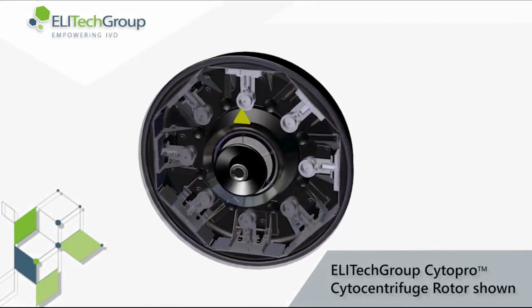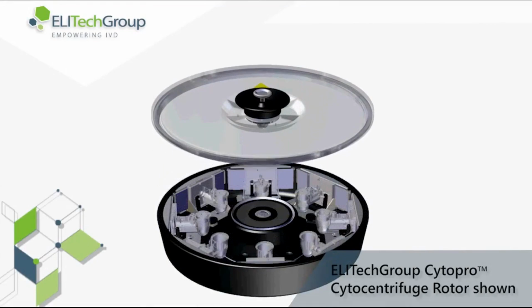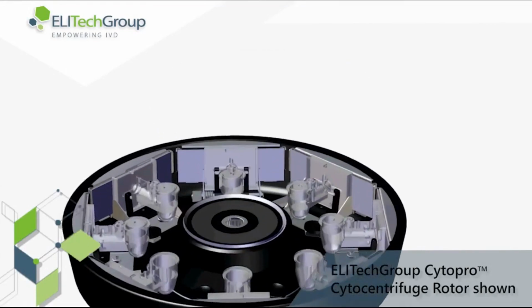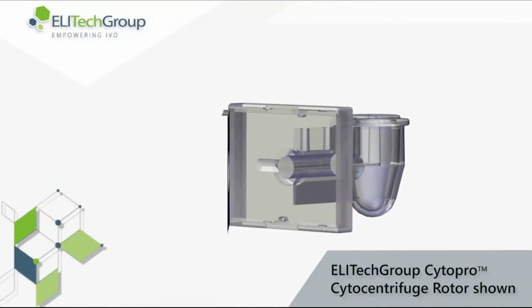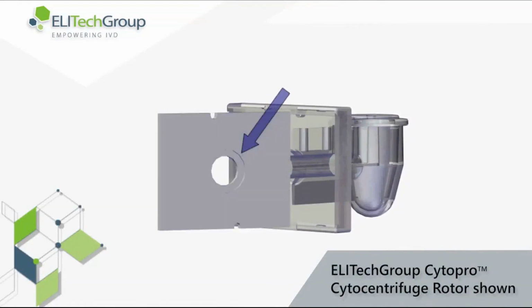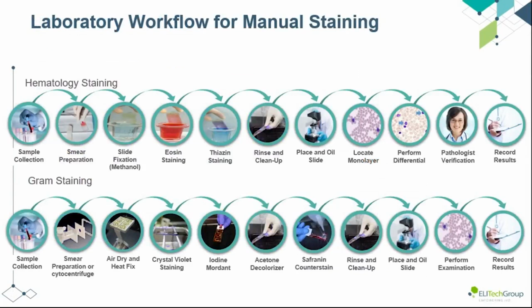In general, a liquid sample is placed in a chamber and then loaded into a centrifuge with the sample slide. As the centrifugal force pushes the liquid and cells outwards, they land onto the sample slide. There is usually some sort of a pad to absorb the majority of the extracellular fluid. The cells that then remain on the slide will be in a small area and much easier to find. Keep in mind that due to the forces, there will be some deformation of the cells, as seen in this image of eosinophils in CSF fluid. Once you have a slide, now we have to stain the slide.